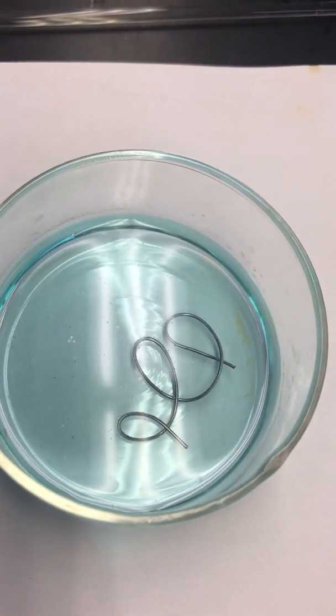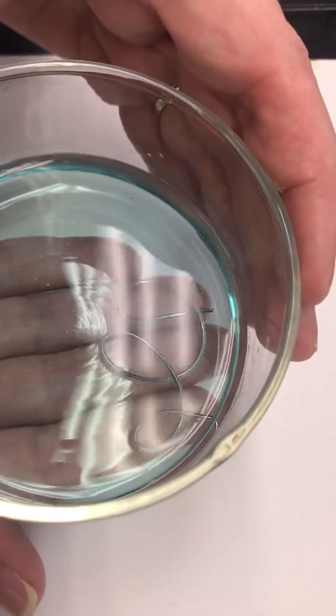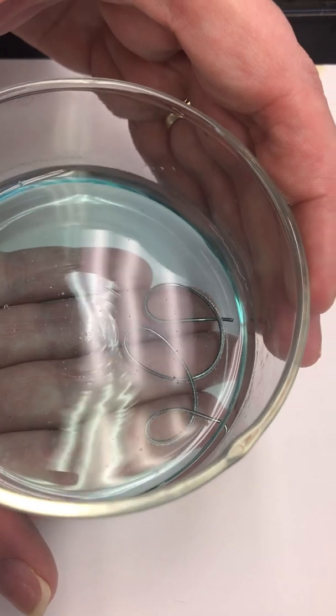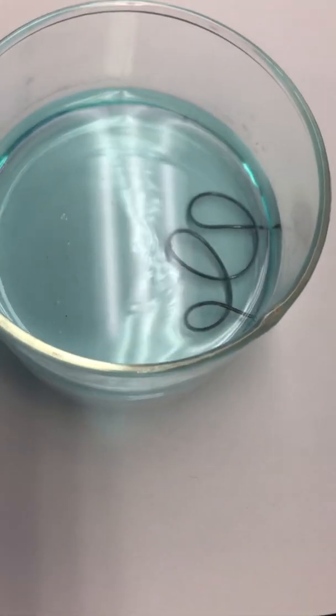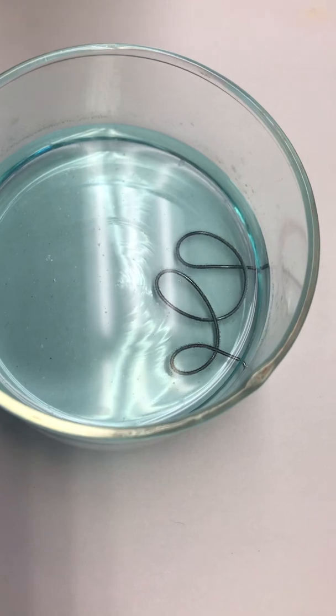so that way we have the products of both of these reactions. One of the things to note is that if I lift this up and I feel the bottom of this, the outside of my Petri dish here is warm to the touch. Okay. So this means that energy is going to be one of my components of my balanced chemical equation.